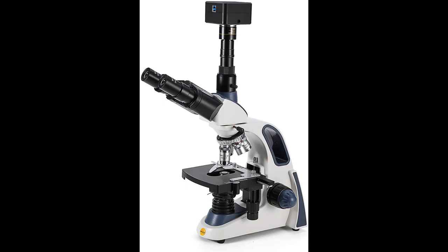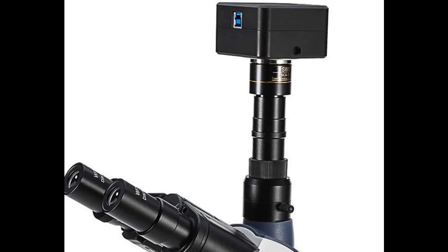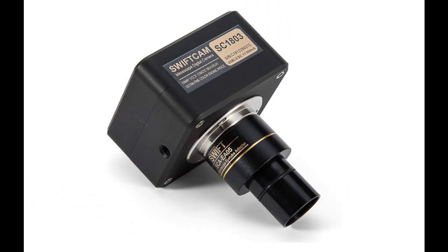The kit includes a software CD with a Swift Imaging 3.0 application and calibration slide to ensure accuracy of measurements. Please note, the software comes on a CD-ROM. If your computer does not have a CD drive, contact Swift for a downloadable file.